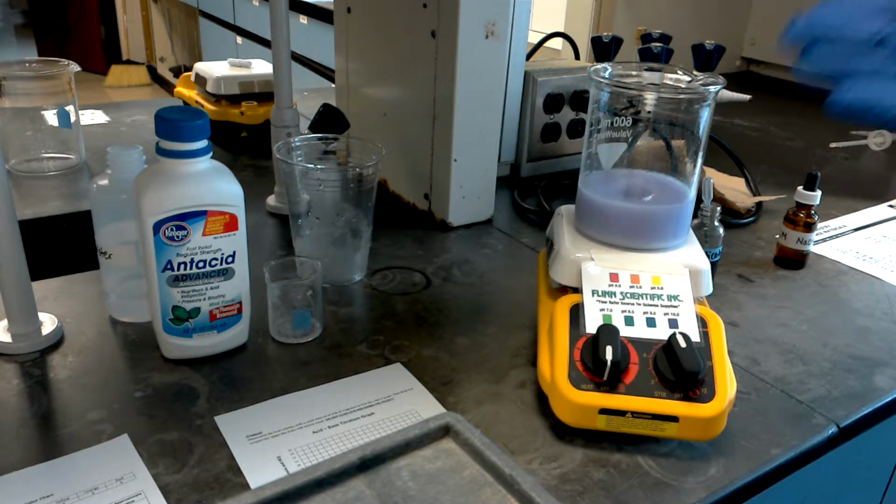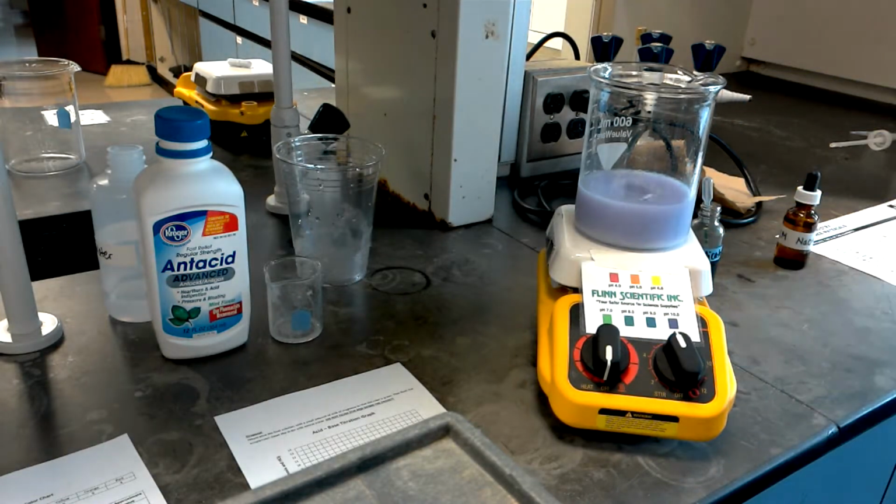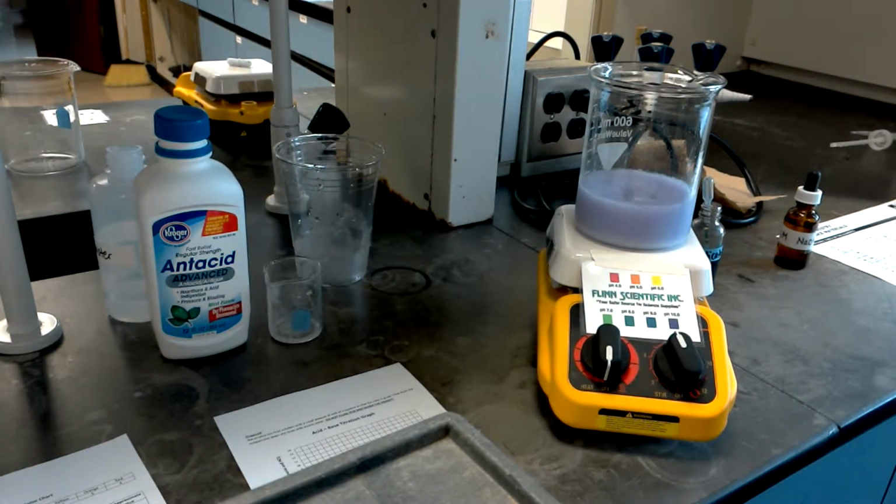Now, after each 2 drops, you need to make an observation, so you'll need to pause the video to make sure you record those. So the first two drops, we don't really see a whole lot of change in the solution, and that's okay because chances are our pH is above 10.